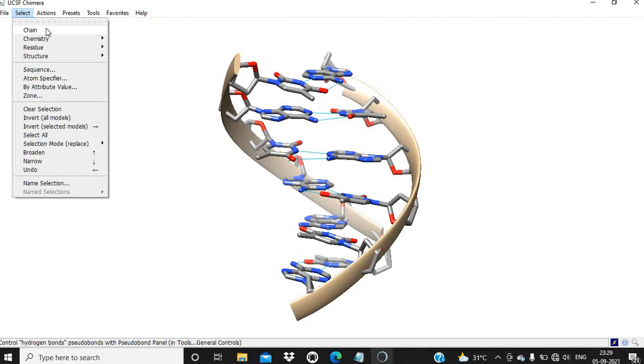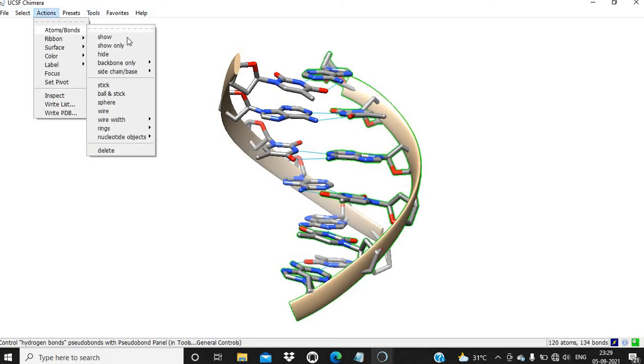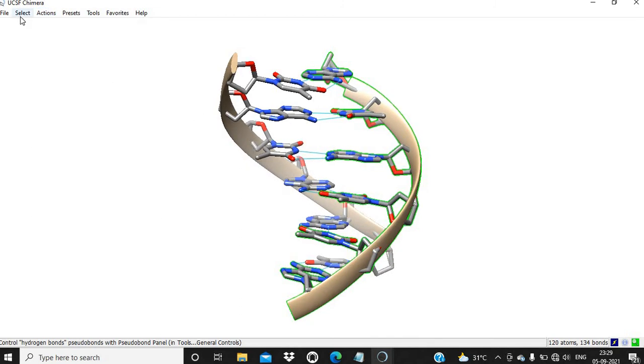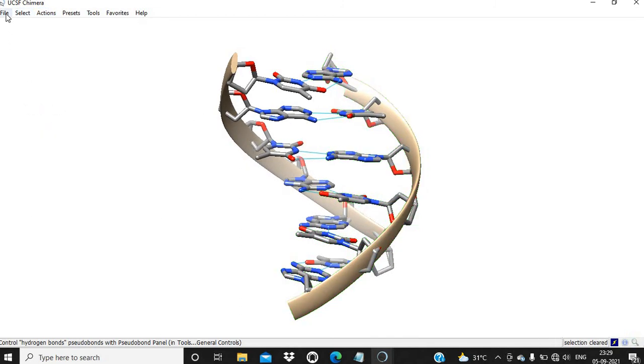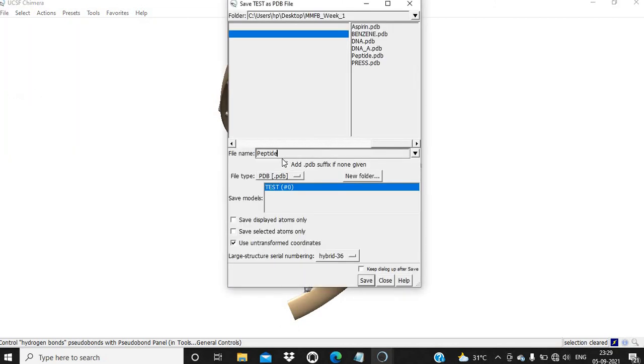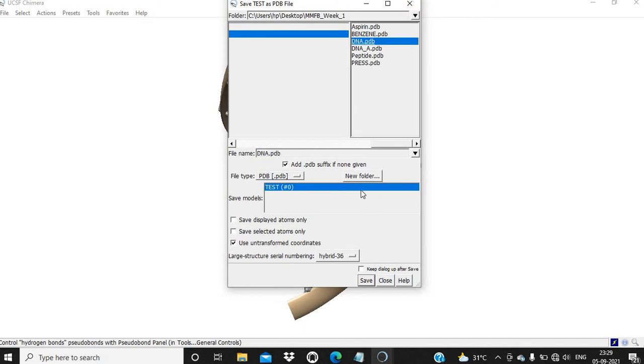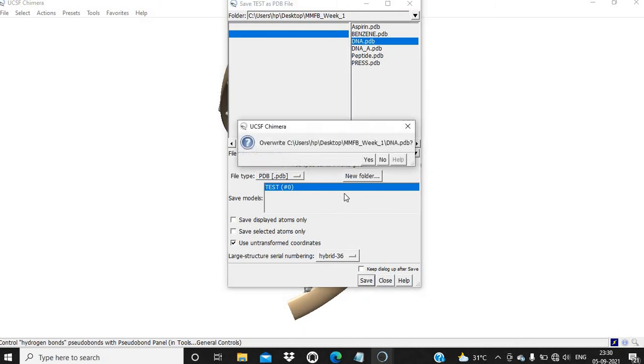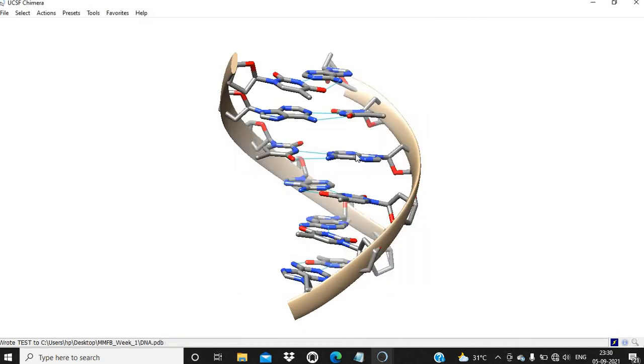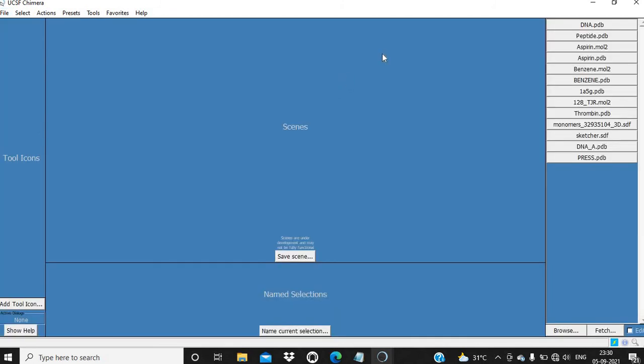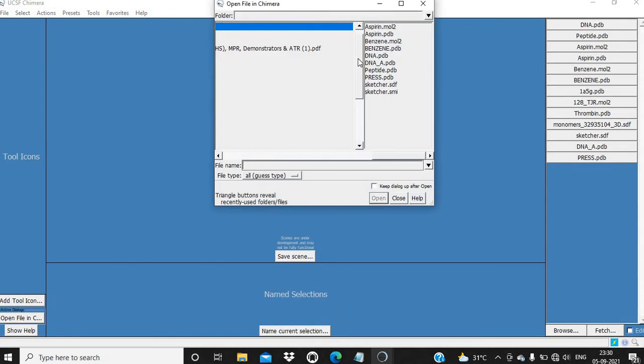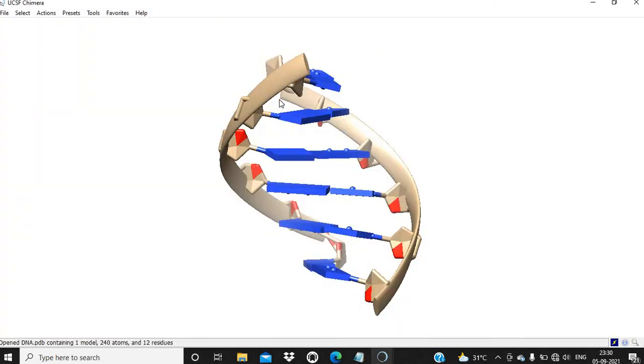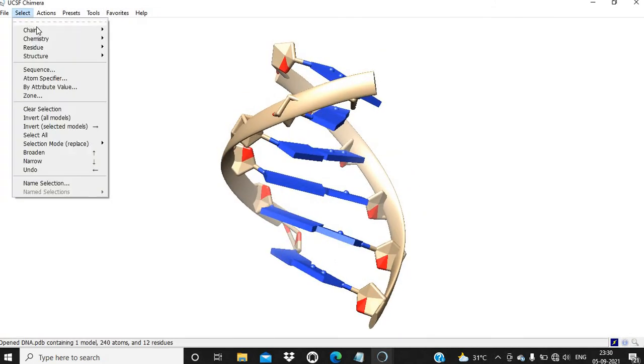Suppose you want to delete one chain. You can delete the B chain. Let me first save this complete structure. File, Save PDB, dna.pdb.